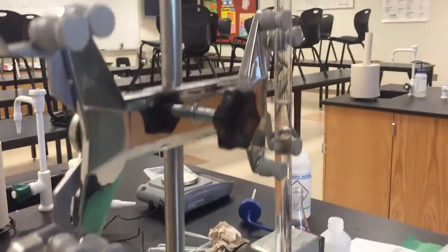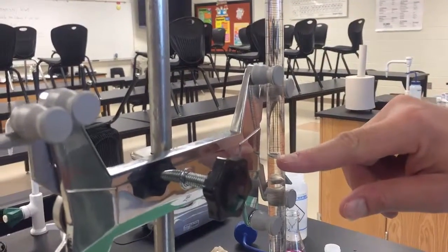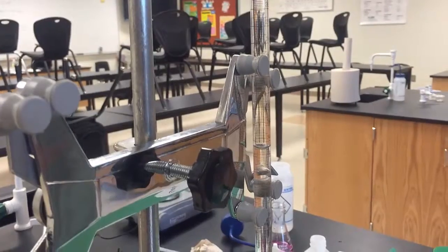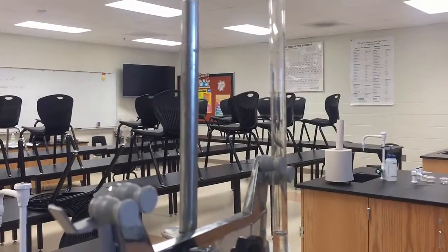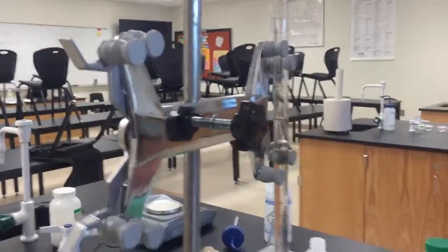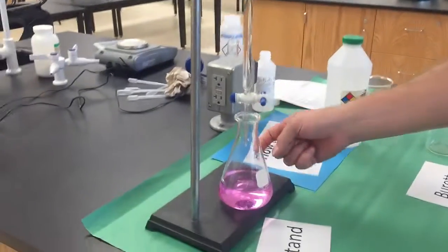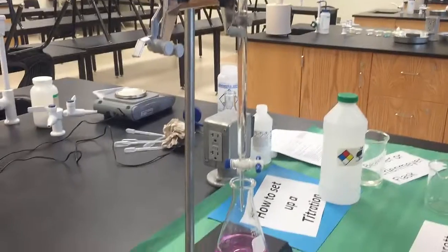The important part is we need to know exactly how much sodium hydroxide we put in. If we don't remember where we started, then the whole trial is off. We need to know exactly where we started and exactly where we ended, and by that we can tell how much volume we put in, and through a little bit of calculations you can figure out what the molarity of that sodium hydroxide is.